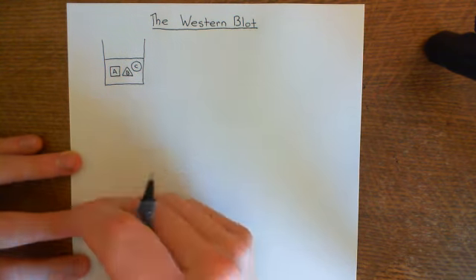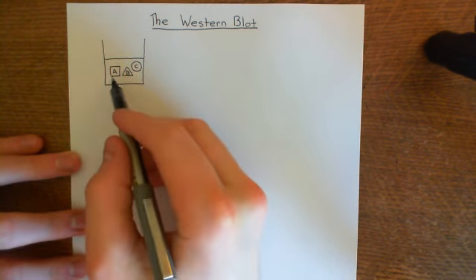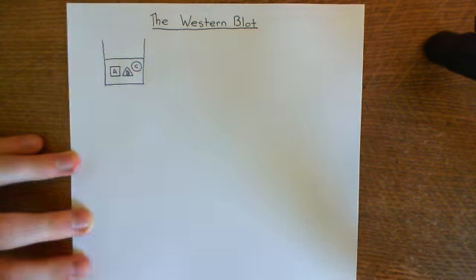You are given a mixture of many different types of proteins, and there is some protein that you're interested in. Let's say it's protein A, and you want to know whether that protein A is present within your mixture. Calling it protein A is just meant to be an arbitrary naming system. It's not supposed to denote in any way that it's protein kinase A. It's just some arbitrary protein. Okay, so that's the motivation.